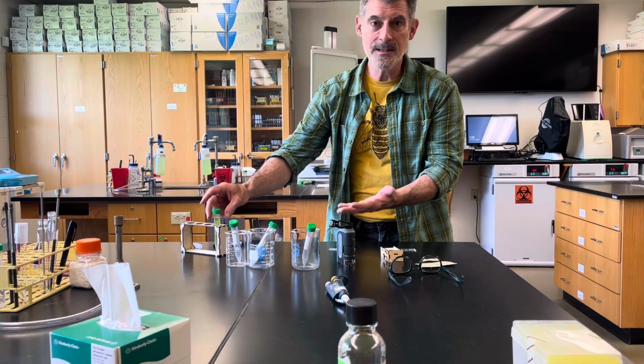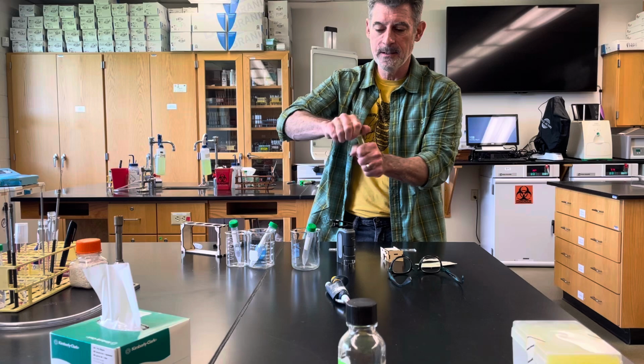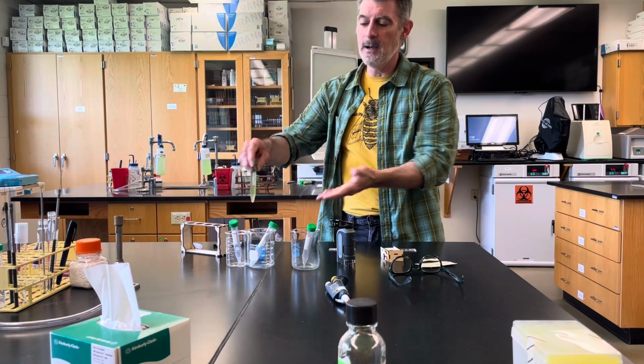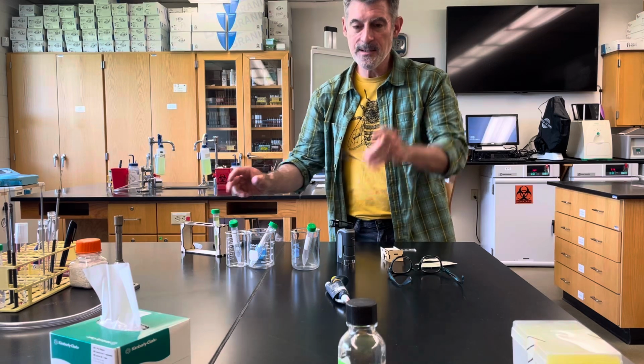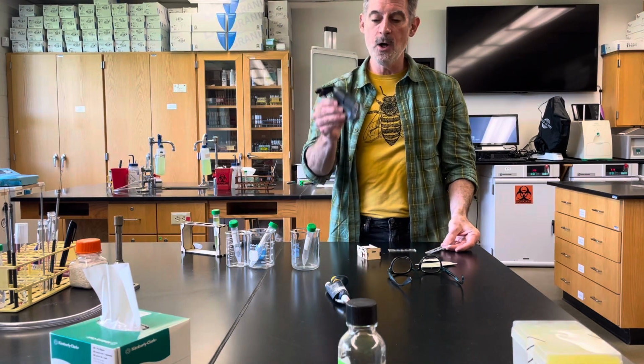But if you're going to take a sample from the tube, don't forget that the cap is loose. Make sure you tighten the cap, then go ahead and mix it, and then you can undo it and then go ahead and take your sample. So now I have a sample on my slide and I want to look at it. So you need your microscope that came with the kit.